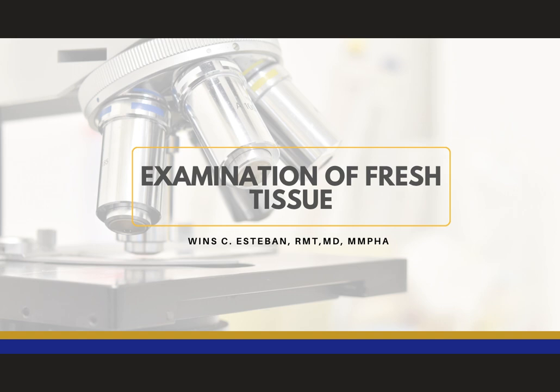Just to go back to some few terms, when we talk about histology, this is the microscopic study of the normal tissues of the body, while histopathology is the microscopic study of tissues affected by disease. The procedures adopted for the preparation of material for such studies are known as histologic or histopathologic techniques. In histopath, the tissues are usually obtained during a surgery or surgical procedure, during a biopsy or autopsy. They range from very large specimens or whole organs to tiny fragments of tissue.